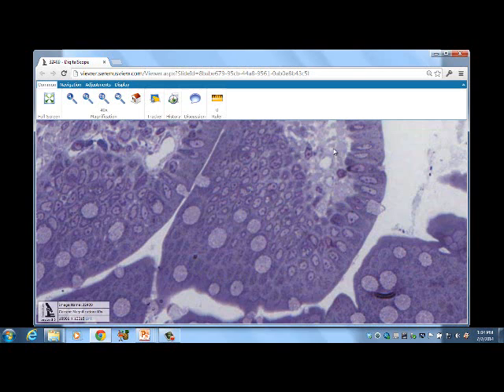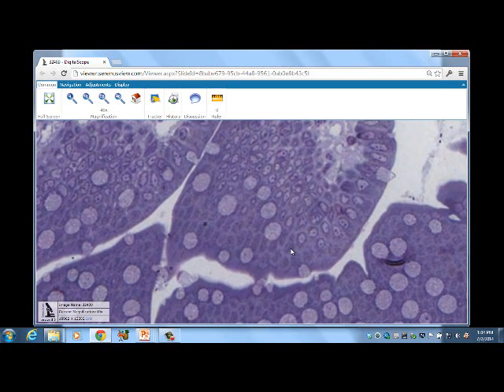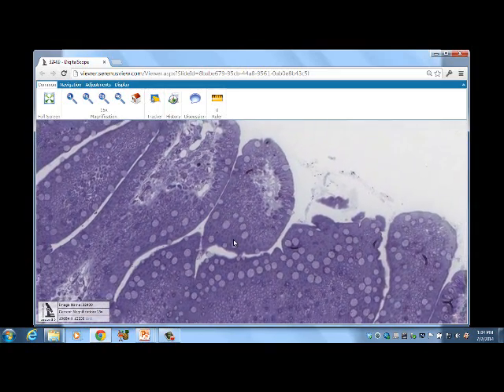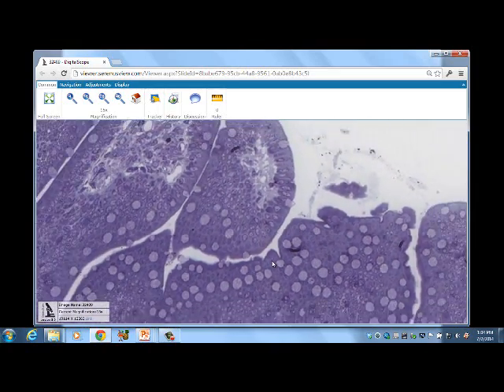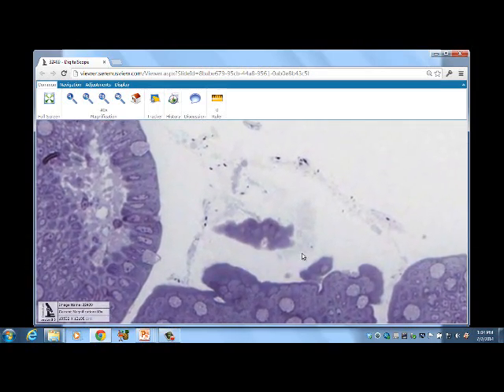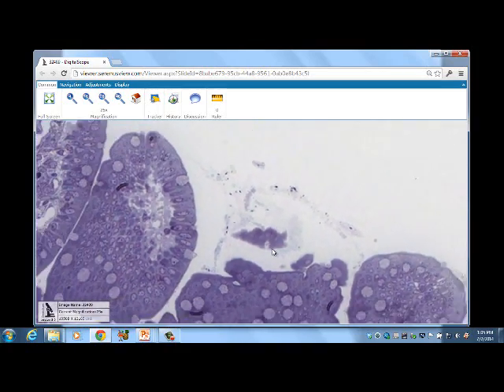This is epithelium, lamina propria, simple columnar epithelium that has junctions between adjacent cells. And by seeing these types of views, you can actually see that the terminal bars are not bars. Here you can see what would be a terminal bar here, here, and here, but you see it actually goes around the cell. So we can see that this is a terminal bar going in and out among the cells that we see. If you have a favorable view of that, you'll be able to see the terminal bars all the way around. Let's see if this is it. You can see the terminal bars.